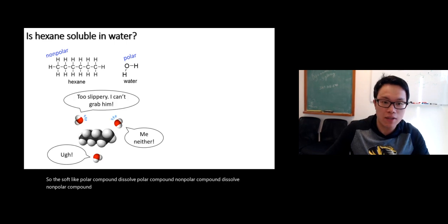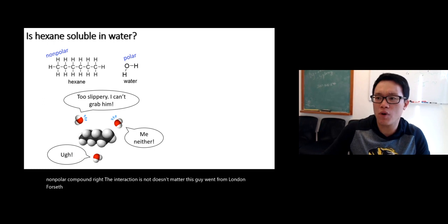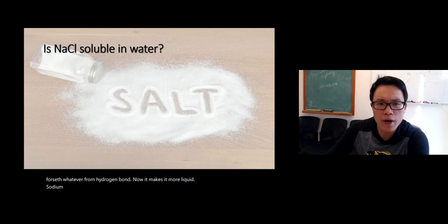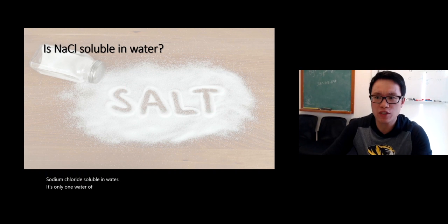The interaction doesn't match. This guy wants London forces, water wants hydrogen bond. No, immiscible liquid. Sodium chloride is soluble in water. Yeah, it's soluble in water. Of course, you've got table salt. You guys know that, right?